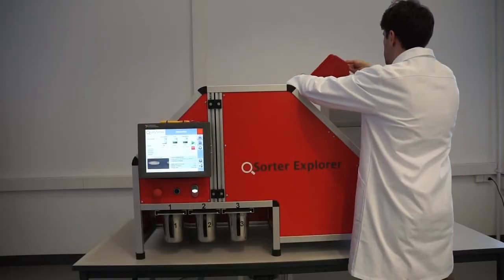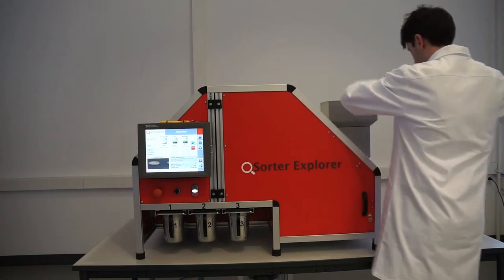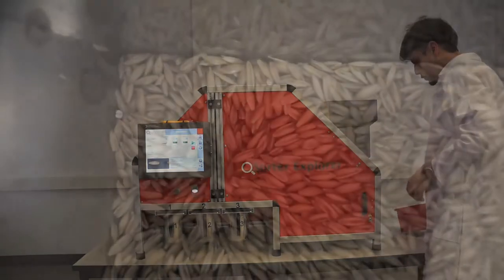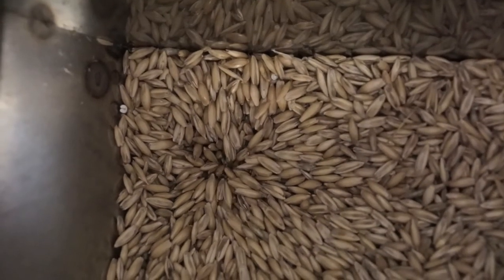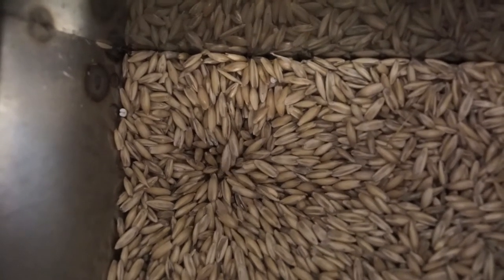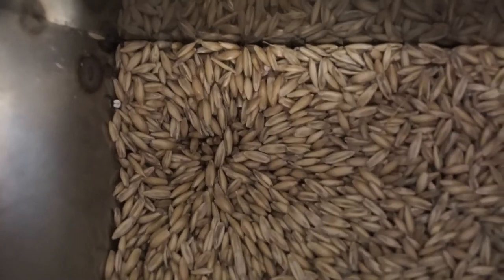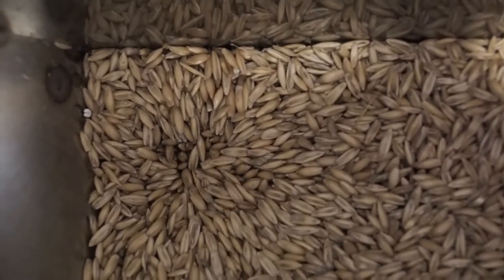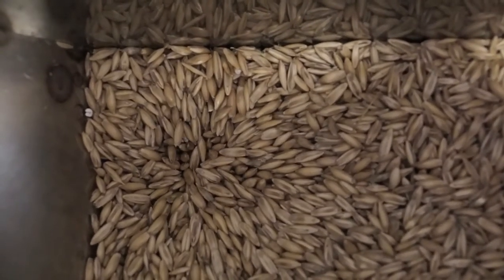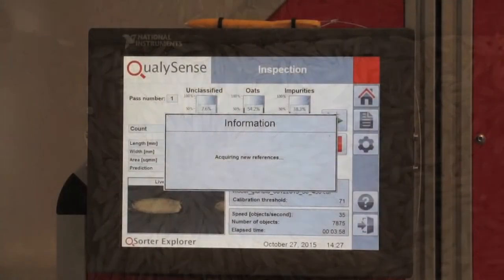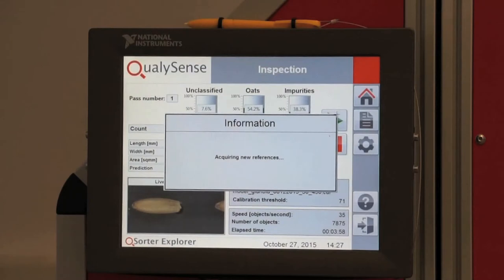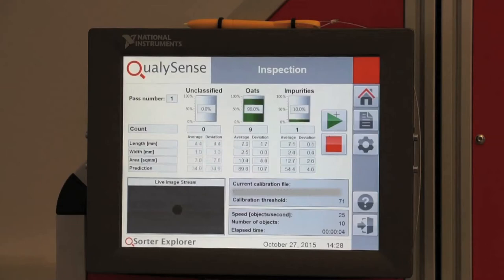The Q-Sorter scans each individual kernel, allowing users to sort crops by pre-set quality grade, to reject bad grains, and to obtain very detailed information about the sample. Traditional scientific analysis methods take too long and the human eye is too subjective. Neither can process a significant sample quickly.